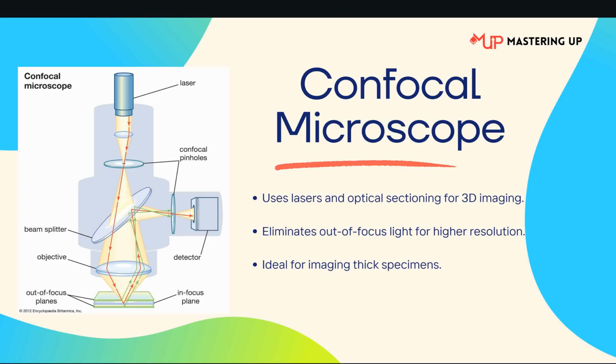The confocal microscope is particularly useful for studying tissues, large cell structures, and complex cellular environments. In cell biology and developmental biology, confocal microscopes are used to image entire embryos or organs in 3 dimensions, allowing researchers to understand the spatial arrangement of cells during developmental stages.